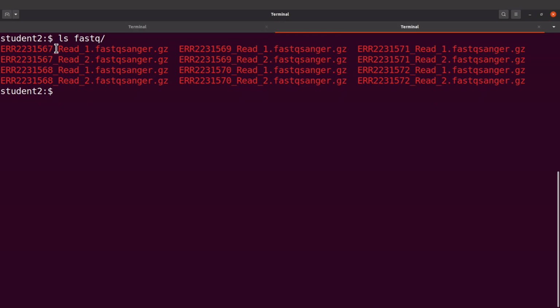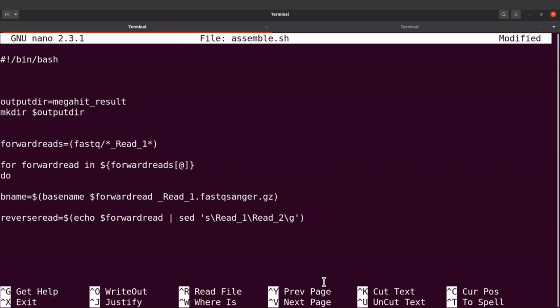So that is why I added this, so that this becomes a unique text. Once we have this unique text, then sed will just take a look at that and swap only those patterns. That's the trick behind whatever we are doing. Okay, so that is what we've basically done here.